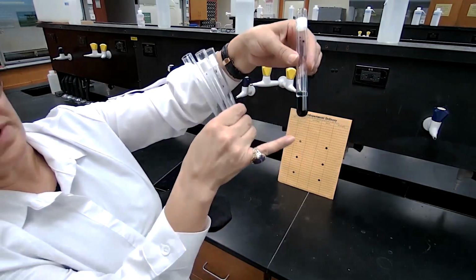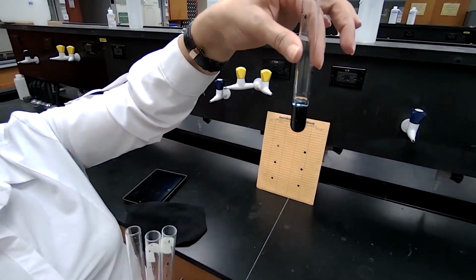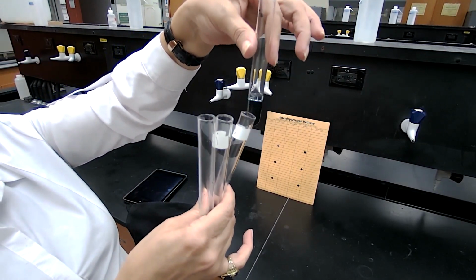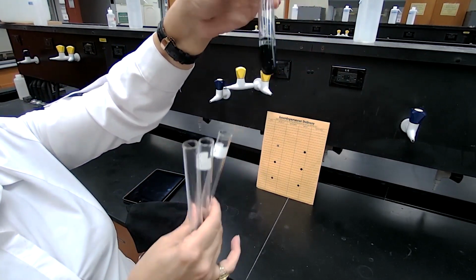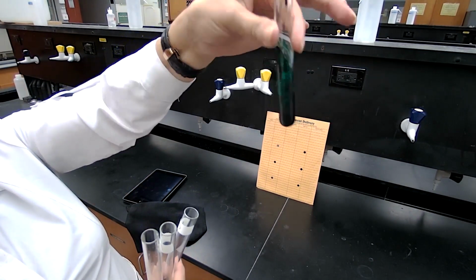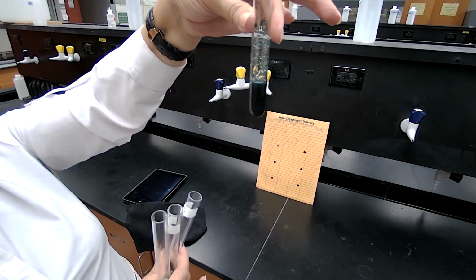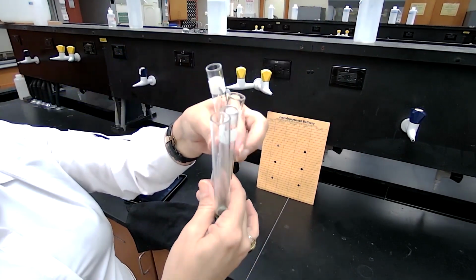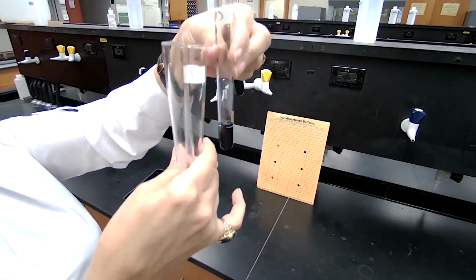Because the picture was not very clear and the video was hard to see, I added a few extra drops of unknown 4, and I added food coloring so you could see the 2 layers that formed better. Even if I mix it, after I wait for 10-15 seconds, it separates. That's for unknown number 1.